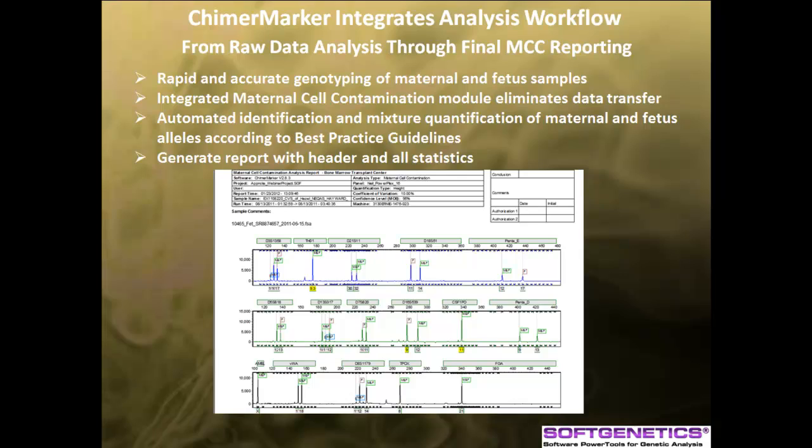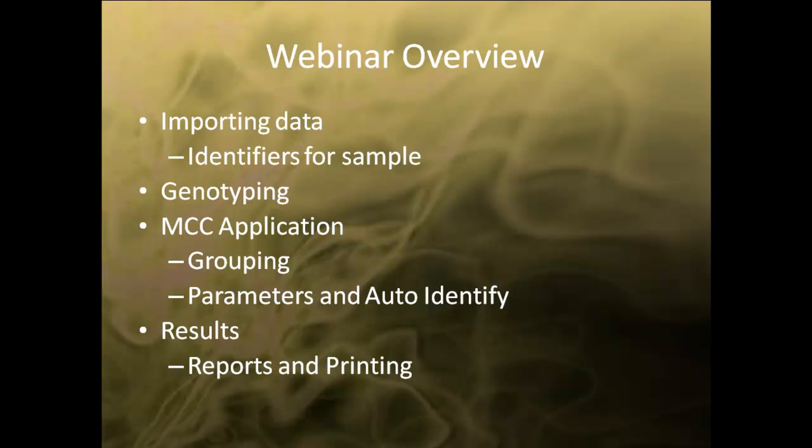The MCC module automatically identifies maternal and fetus sample alleles and completes a mixture quantification according to best practice guidelines. After analysis, the user can generate a full summary report of all loci using two mouse clicks.